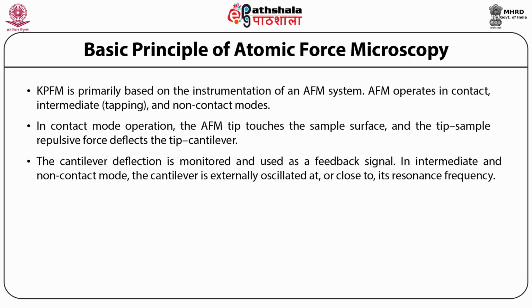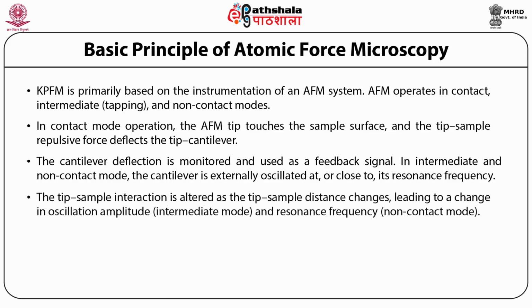In intermediate, the non-contact mode, the cantilever is externally oscillated at or close to its resonance frequency. The tip sample interaction is altered as the tip sample distance changes, leading to changes in oscillation amplitude, intermediate mode, and resonance frequency, non-contact mode.